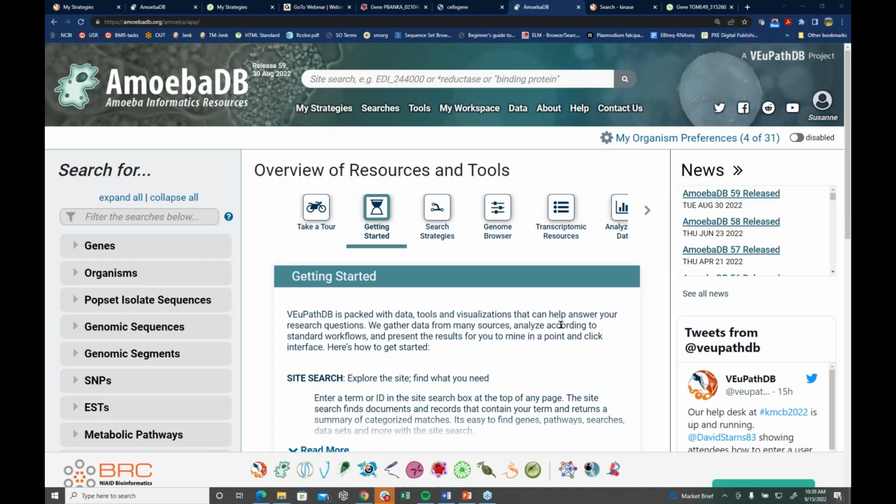One more thing, since all of your transcription start site data is the same thing as what we put into AmoebaDB, I thought that I could show a couple of the AmoebaDB tracks.